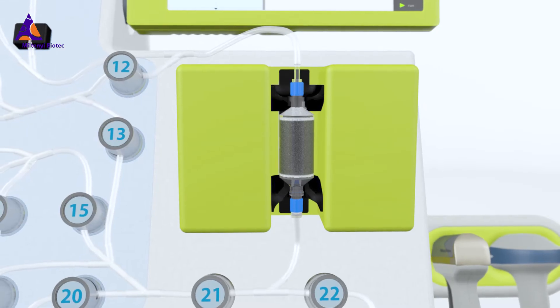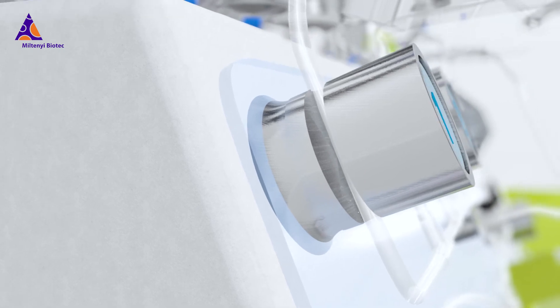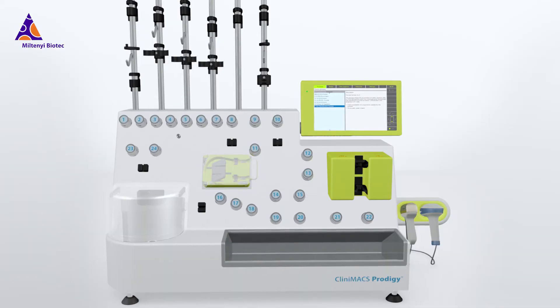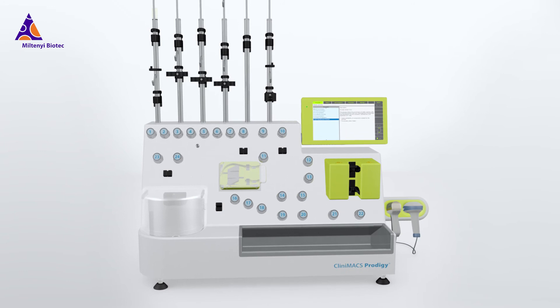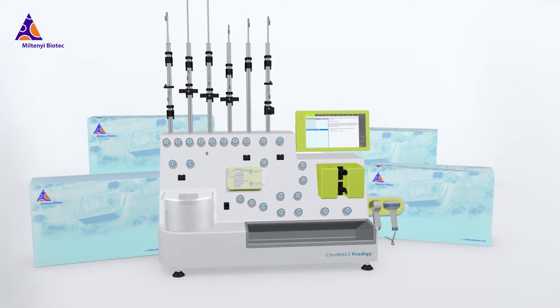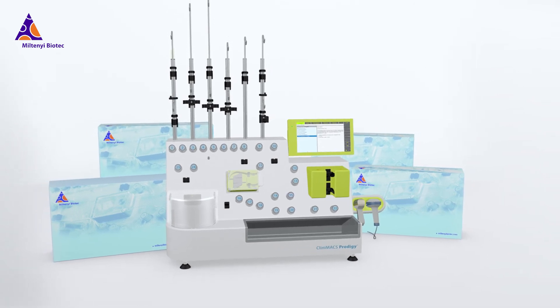After each production run, the complete tubing set with all its components can be removed from the instrument and disposed. The instrument is directly ready for the next cell processing cycle. The combination of the Clinimax Prodigy instrument and the Clinimax Prodigy tubing sets is the basis for safe and reliable manufacturing of your cell products.